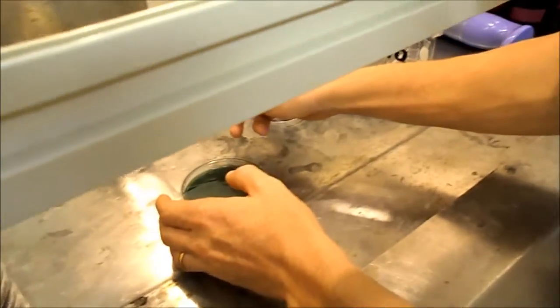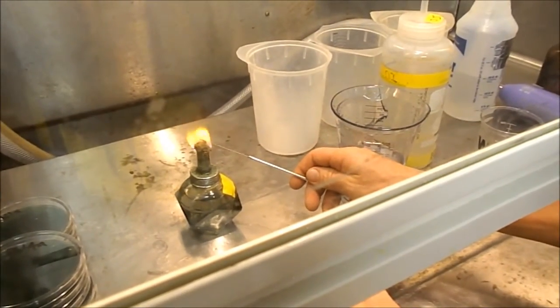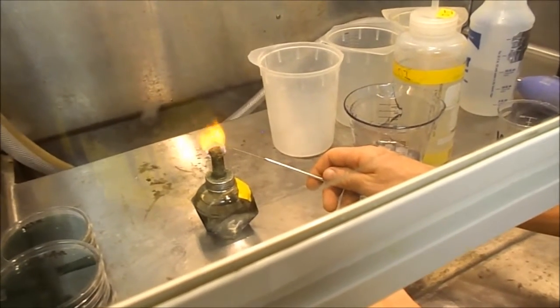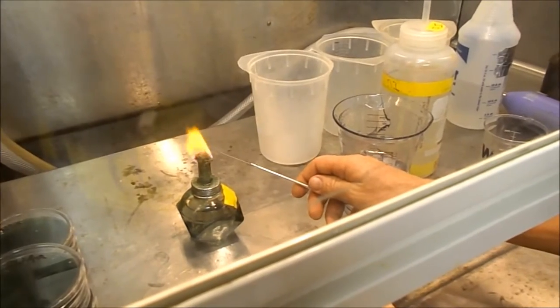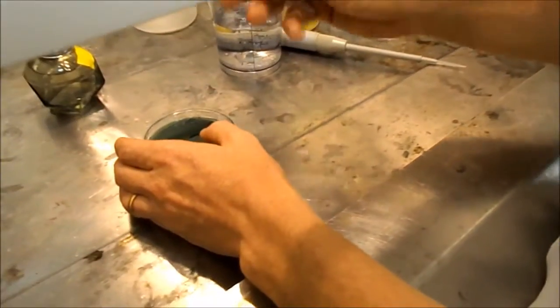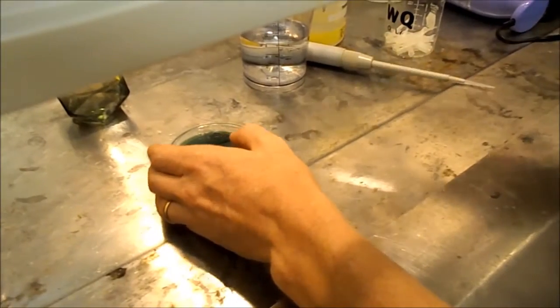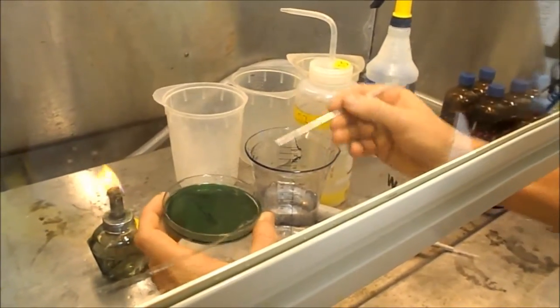Tip to go red hot. So it's going red there. Take my sample from here.